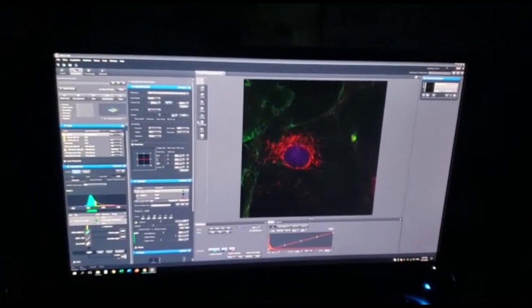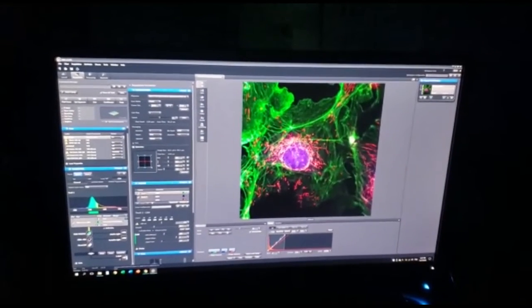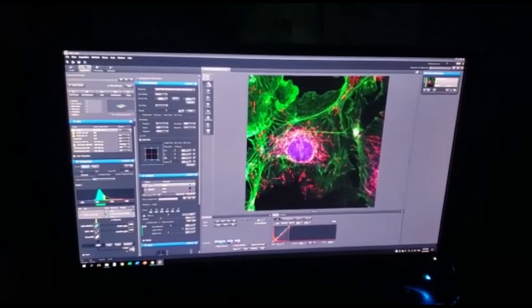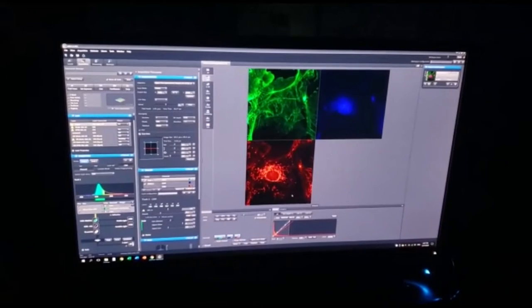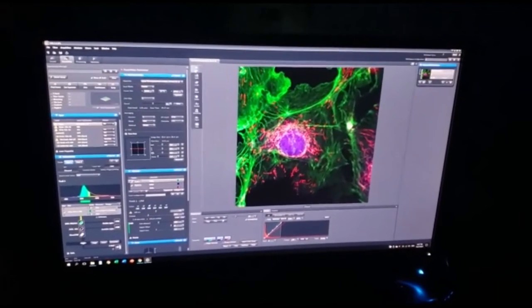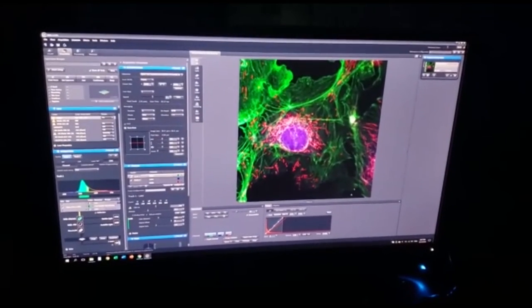As you can see, the image that we obtained for this sample is very good. We have 3 different fluorochromes for 3 different parts of the sample, and after a best fit we can observe how the 3 different parts are dyed in a different color with a different composition of the fluorochrome. This image is very good in comparison with other images that we want to have, but this is a commercial sample. After that, we can choose other techniques.